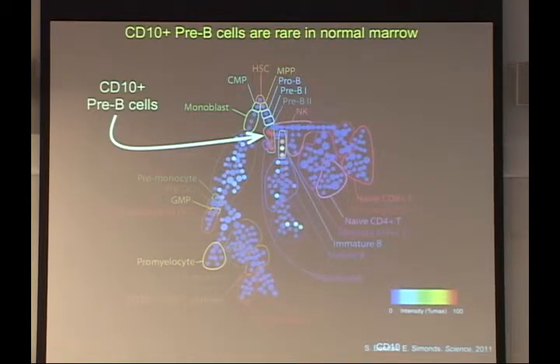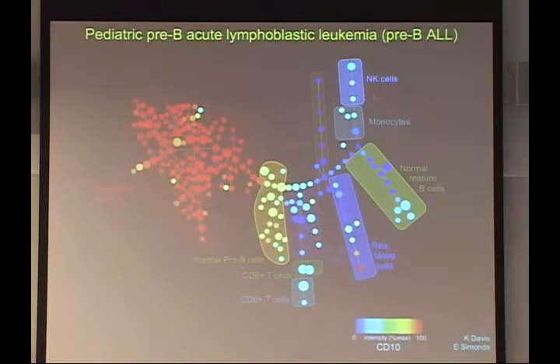With pre-B-cell ALL, what happens when you do a SPADE representation of leukemic bone marrow is, here are your CD10 positive cells. Most of the bone marrow has been taken over. I think this particular case was 98% CD10 positive. A cool thing SPADE can do is, even with this big tumor of CD10, and even though we didn't have all the right markers in there, of the 2% of cells left, you can still see a lot of the normal immunological cell types.